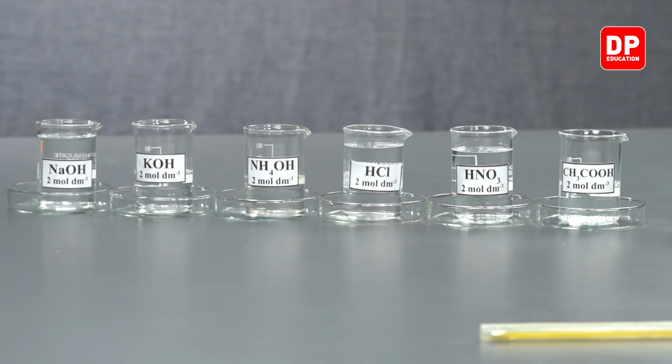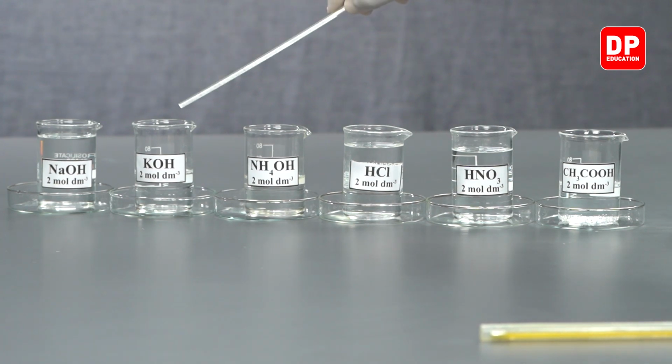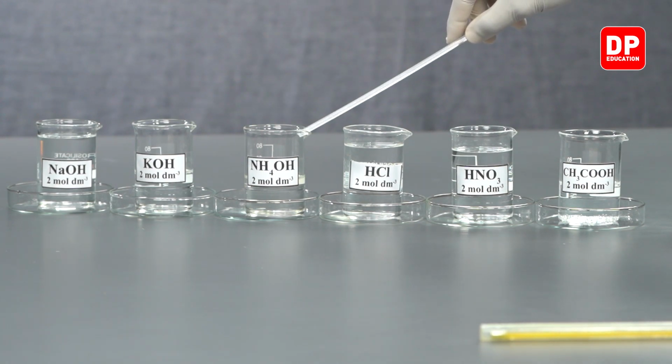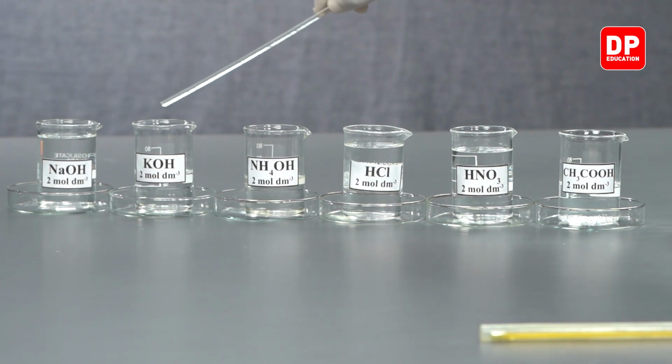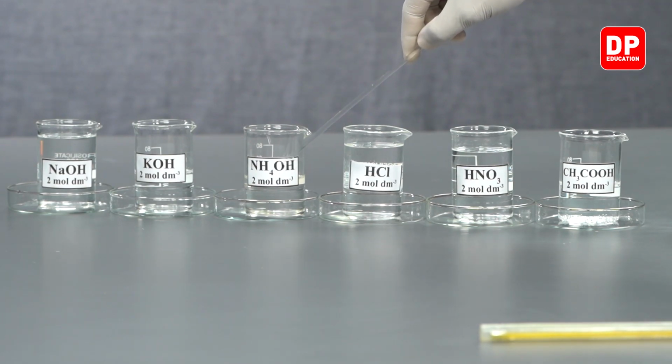We will be using sodium hydroxide, potassium hydroxide, ammonium hydroxide. These are the 3 bases we will be using, and you can see the concentration of each of these solutions. Each of these solutions has a concentration of 2 moles per decimeter cubed.